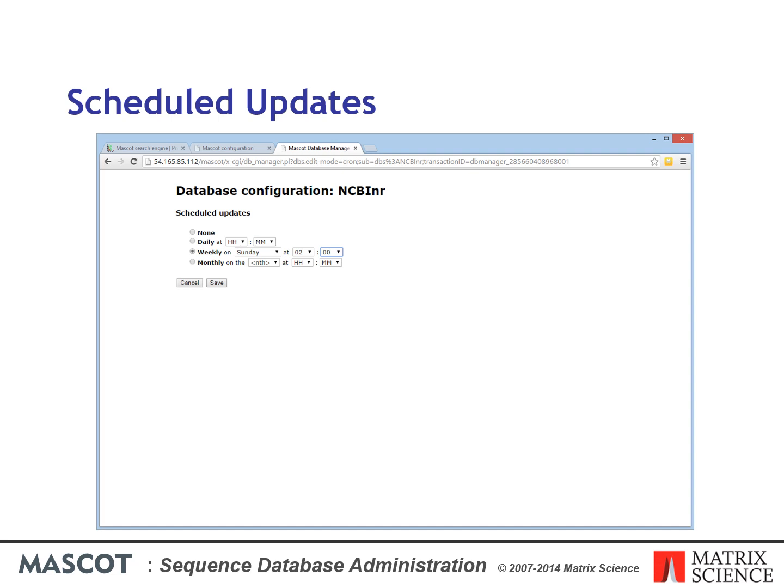The only requirement for keeping the files up to date is that the definition includes URLs for downloading the required files. Files are not updated by default. You have to save a schedule for the database specifying how often to look for new files. If no new Fasta file is available at the scheduled time, nothing will be downloaded.